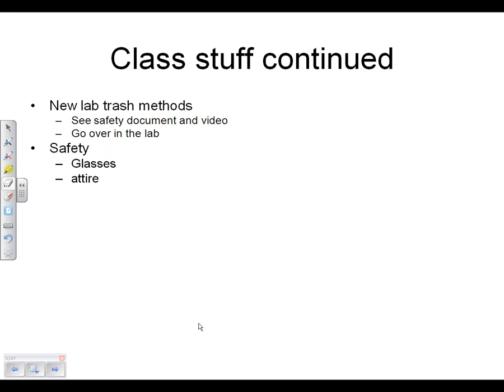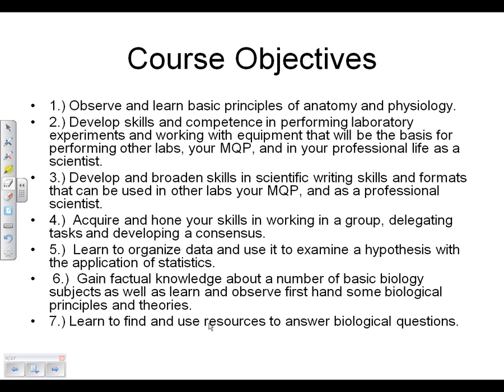Remember proper lab attire, which isn't so hard in the winter time. Completely covered up, closed-toed shoes, and make sure you bring safety glasses. We do have loaners if you need them, but you never know who wore the safety glasses before, so it's always nice to bring your own. All right, so that's just a few words in the background that Ali will cover in the other lecture.